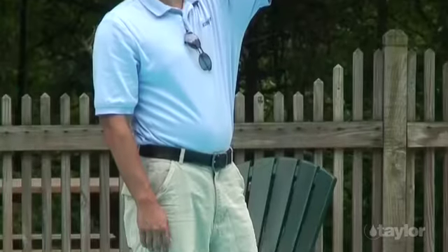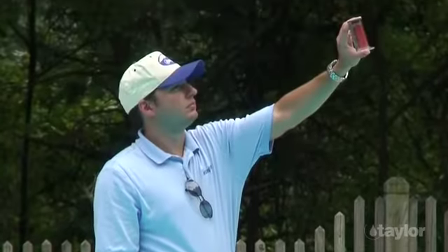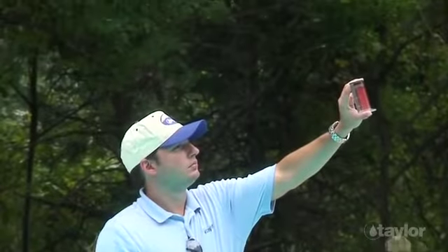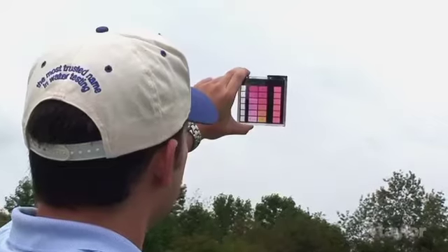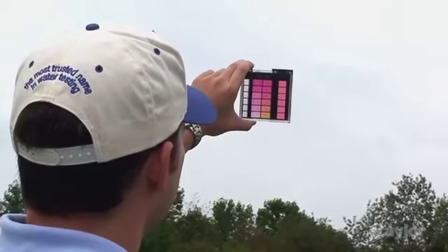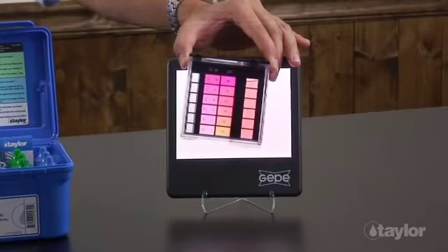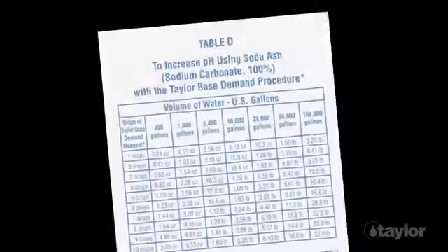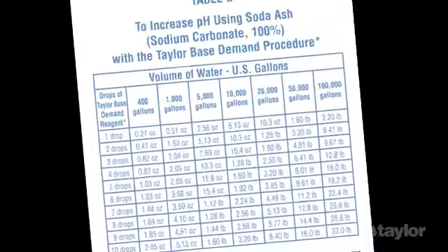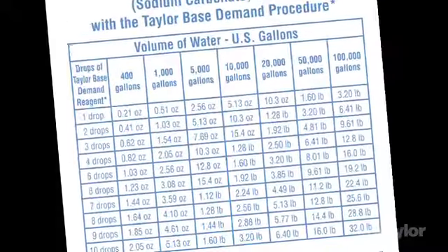Color matching should be conducted outdoors in natural, northern light, or indoors with the aid of a daylight simulator. See the treatment table in your guide to continue.